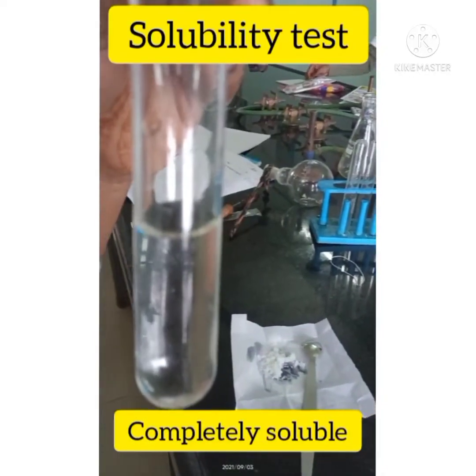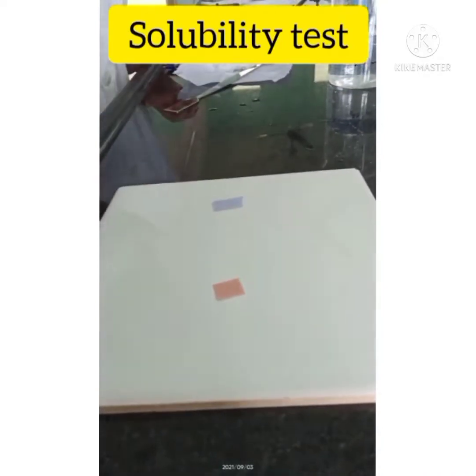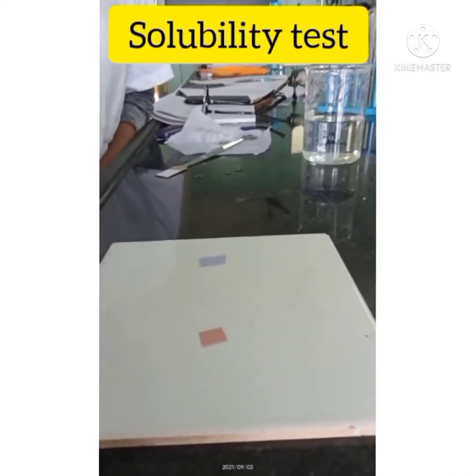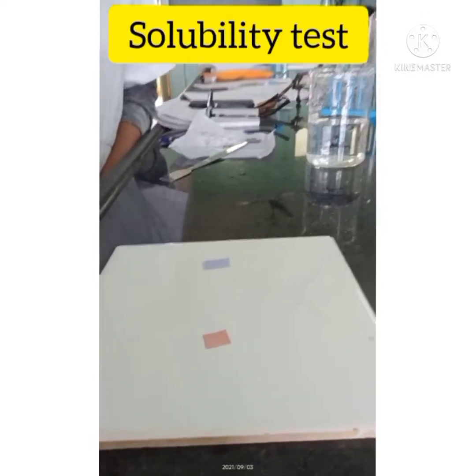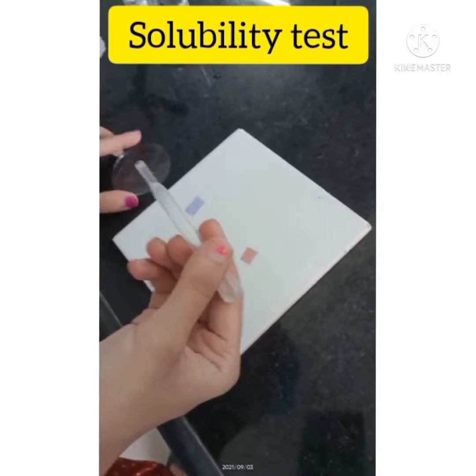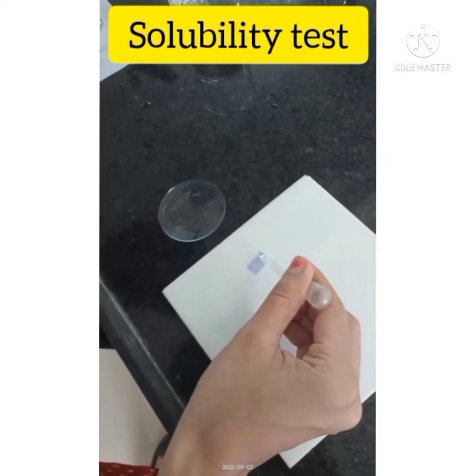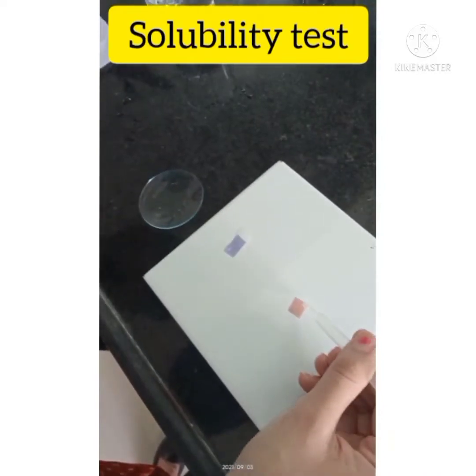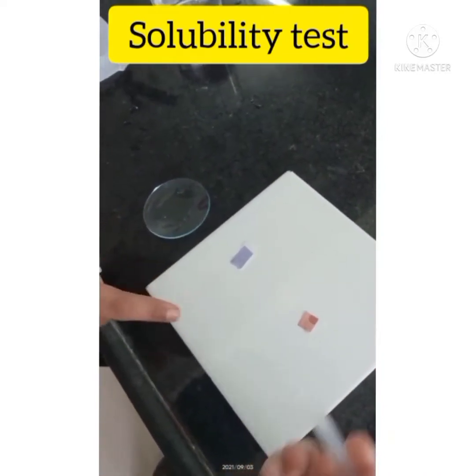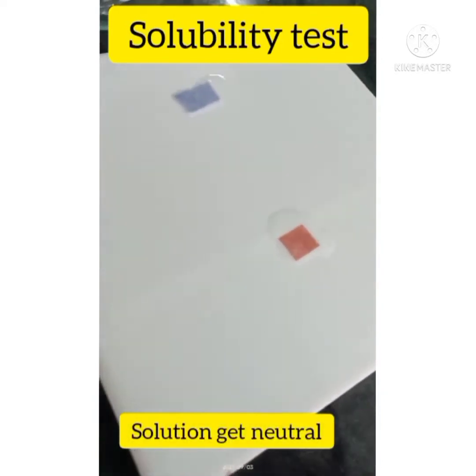Then we perform the litmus test, in which we take red and blue litmus paper and add a solution of our compound. There is no change in pH, which means the solution is neutral.